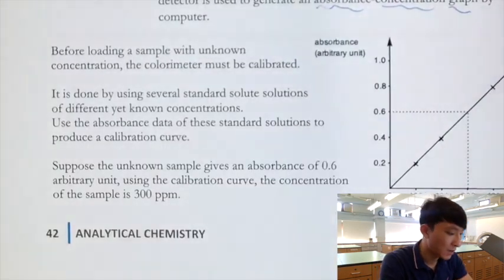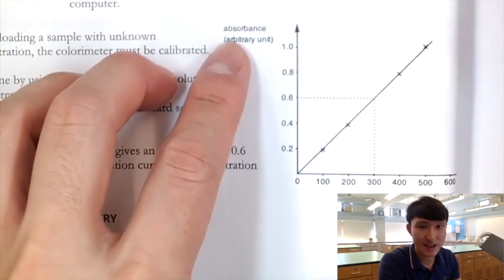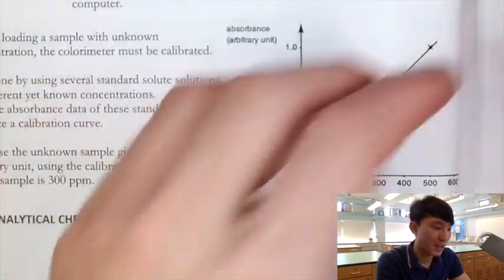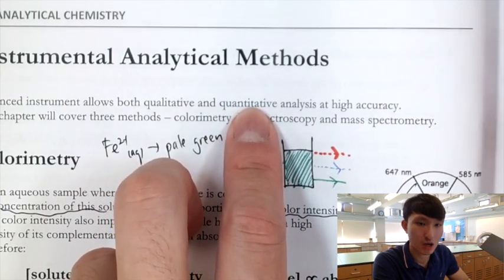All right. So now you may ask a question. Obviously I understand that with a higher concentration of solute, it will have a higher absorbance. But like I previously said, we are trying to carry out quantitative analysis, right? So how much?